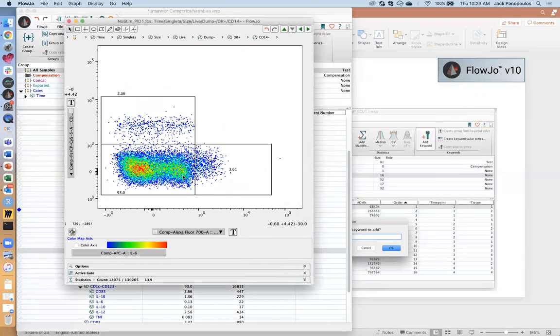As you can see, it's a bit fuzzy what we're considering positive and what we're saying is negative. The more distance you put between the positive and negative, the more you stretch this out, the better the results are going to be when you cluster or use tSNE. It helps the algorithm see what is positive versus what is negative.